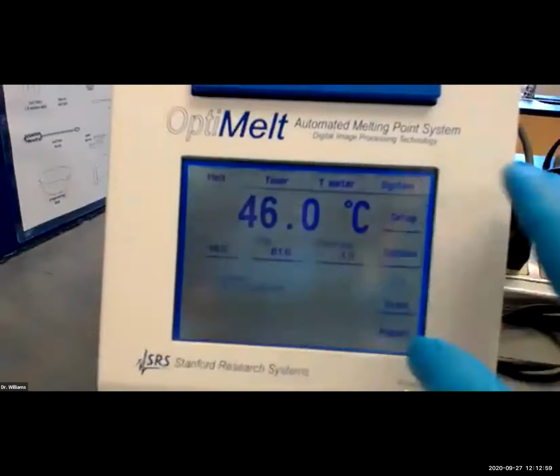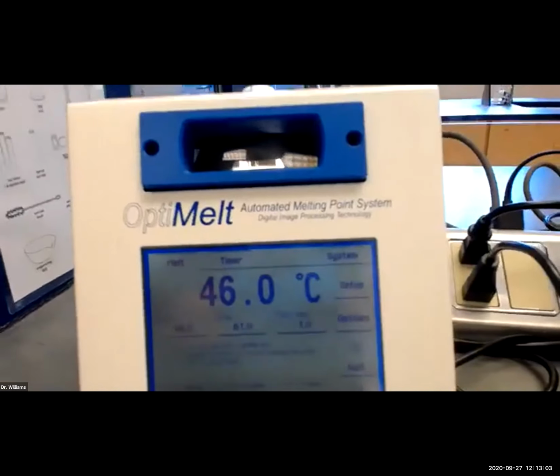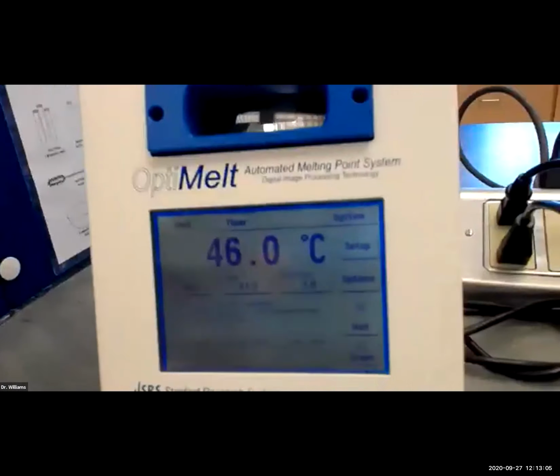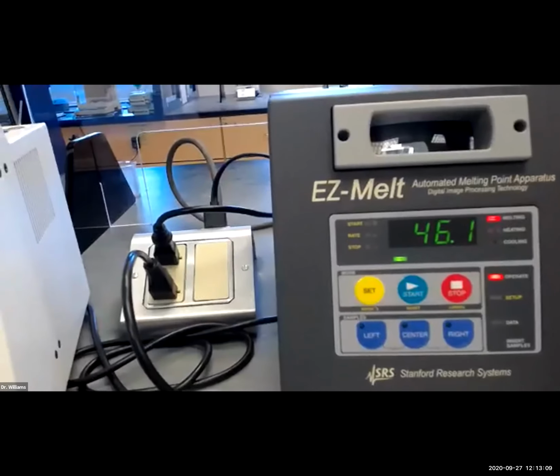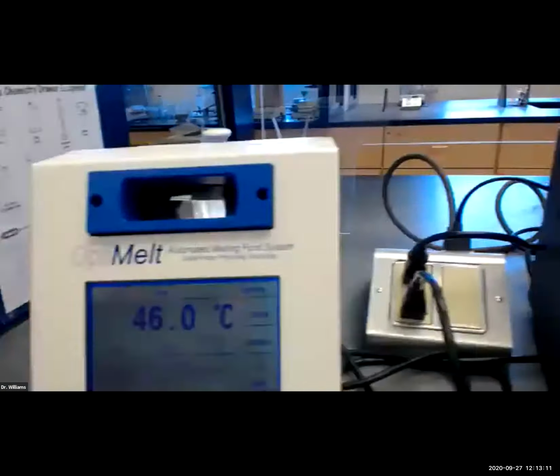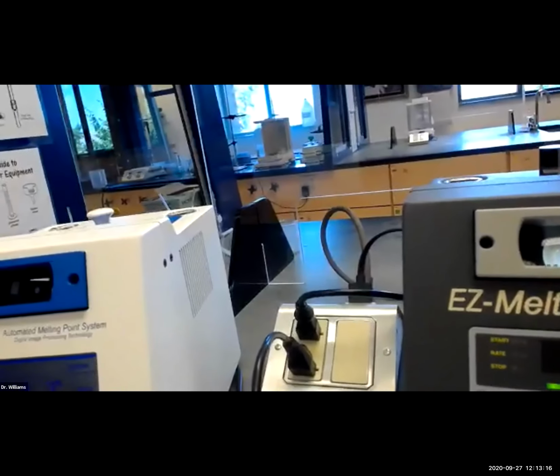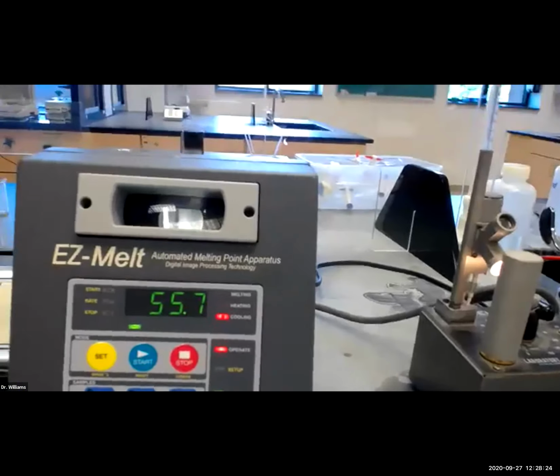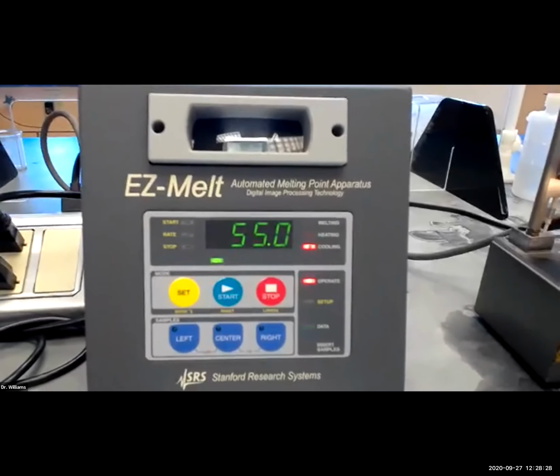Over here, everything's good to go. Sample's inserted, press the start. Now it's on its own. So it will measure the melting points. It'll record the melting point range. And then you'll hear a sound, the beeping sound. It will tell you the analysis is finished. So we're going to put this on pause. Alrighty, folks. So I've heard the beeping sound.